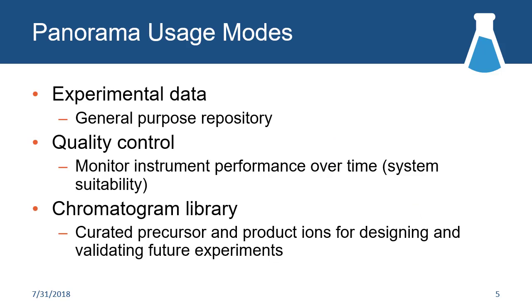So I think we got some examples from some people just a minute ago on these first two types of usage. What we've tried to do within Panorama is to set things up so that there are consistent workflows and consistent user interfaces designed around a given purpose. When you create a folder within Panorama, which is the organizational unit, kind of like a folder on your desktop, you get to choose which of these modes you want to be working in. I think Geisha will be showing some examples of this in the hands-on session.